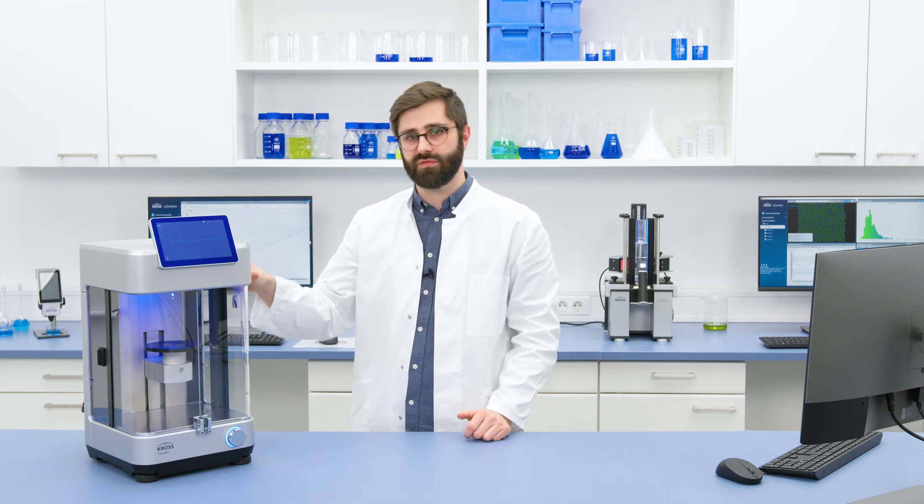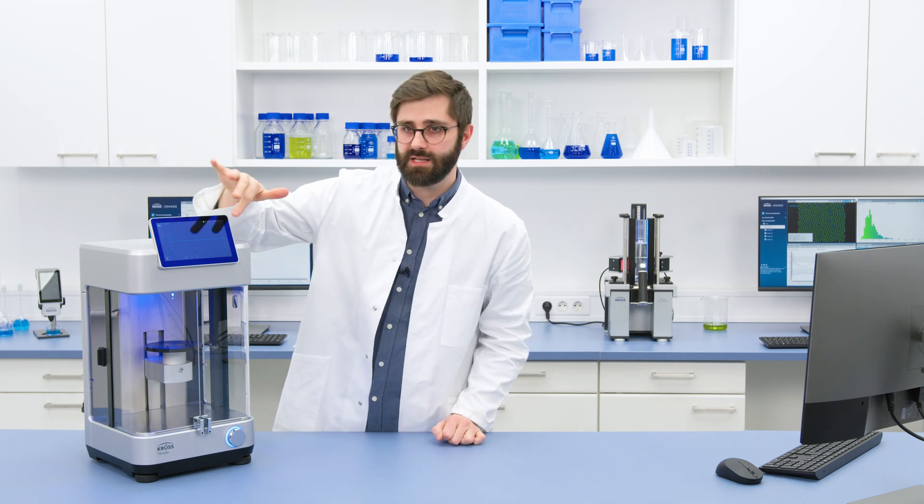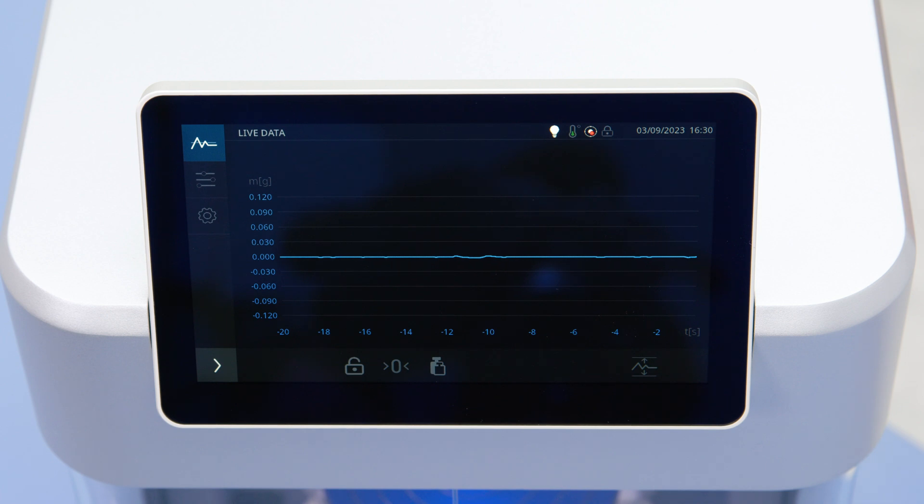You can use that to control all the different functions of Tensio as well as monitor the live readouts from the high-resolution force sensor or the other environmental sensors.